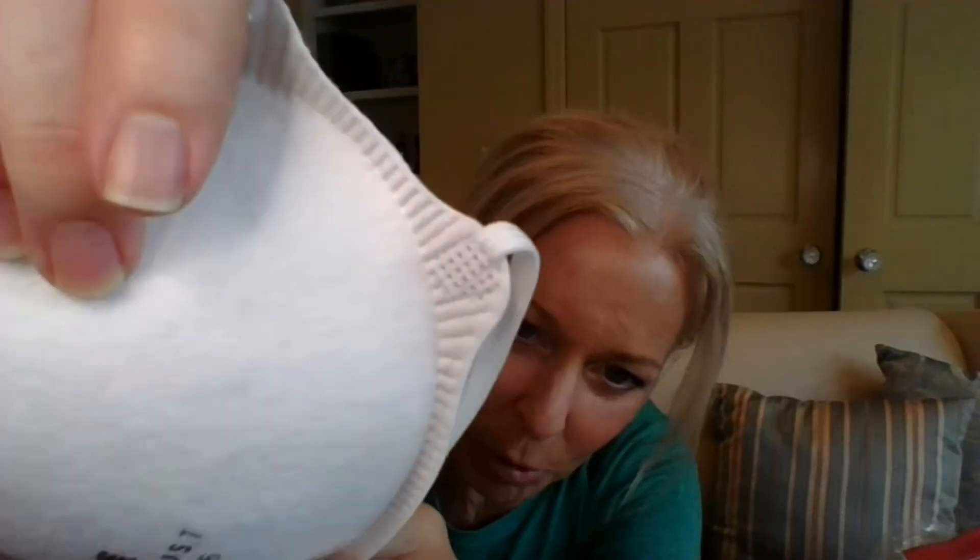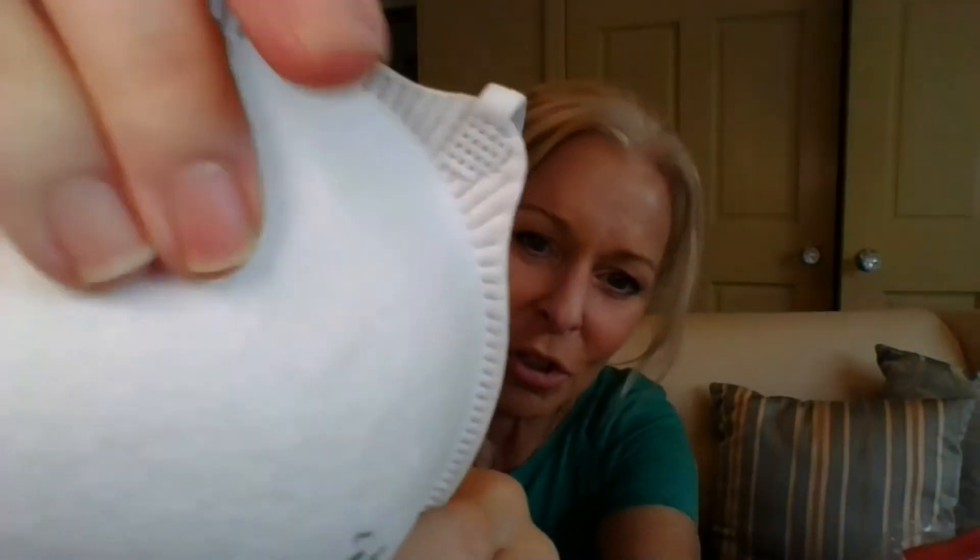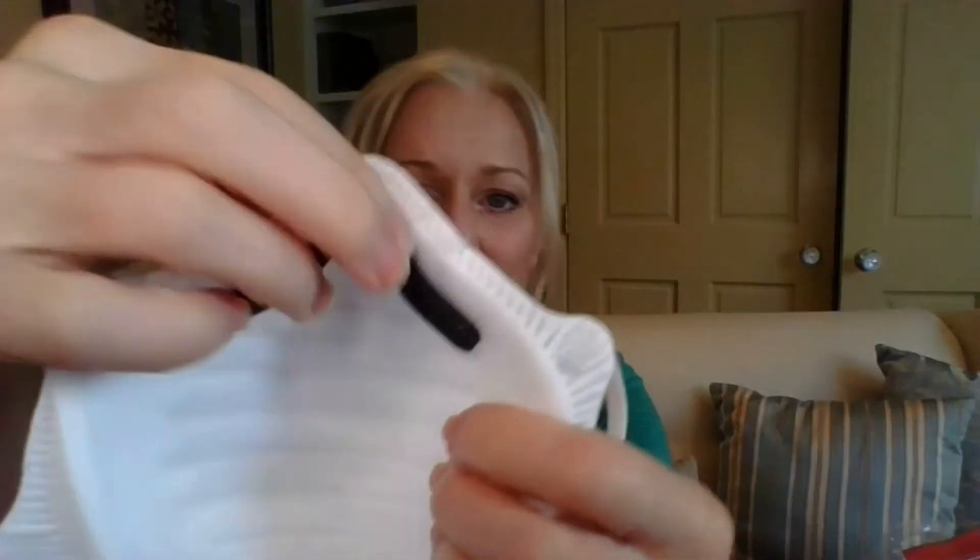When I take this out of the box, it looks very different than the ones I've shown before. This is polypropylene — I can feel it. It feels almost styrofoamy because this is just a very thick material. You can see that it is a non-woven. They have their name and model number on it. When you turn it around, you can see they do have foam. When I reviewed a respirator recently — that was the Demetec — it had foam here around the nose piece and I couldn't get a good fit with that particular respirator. It was leaking all over the place. In this case, it just didn't fit me and therefore isn't going to work for me. So we're going to see how this one works.